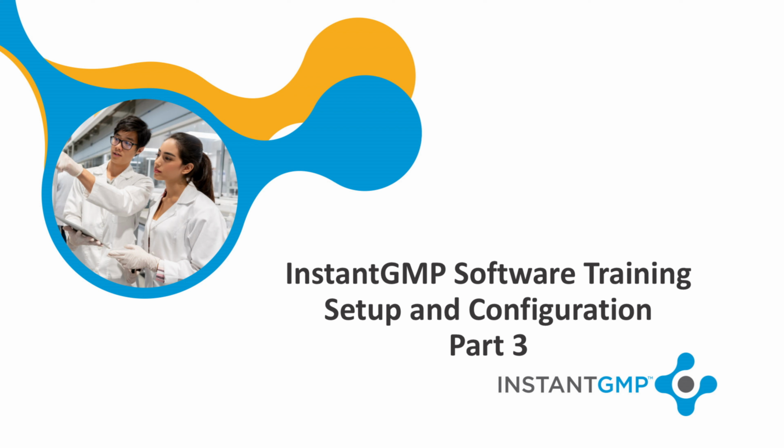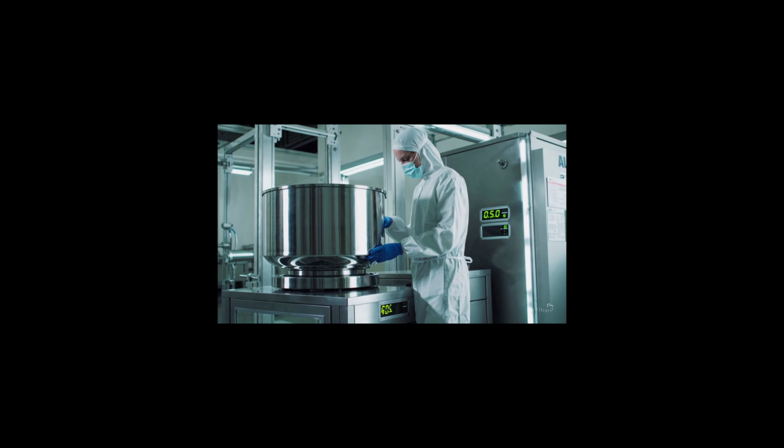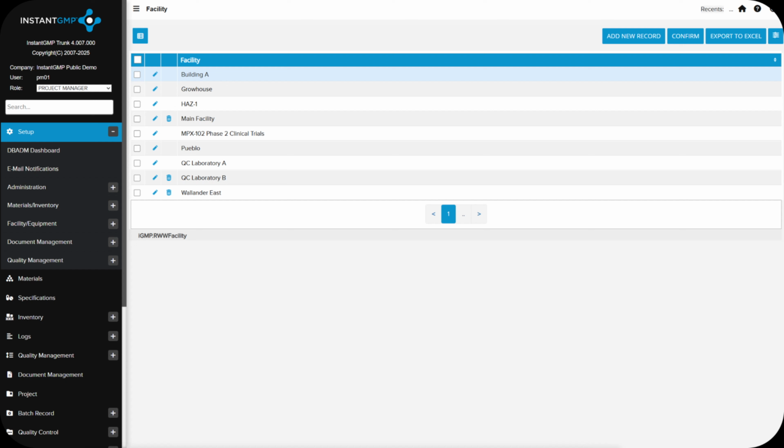In this session, we'll explore how to set up and configure 3 key areas: facility and equipment, document management, and quality management. In all cases, these are lists that can be modified to meet your company's nomenclature and processes. Let's start with facility and equipment.